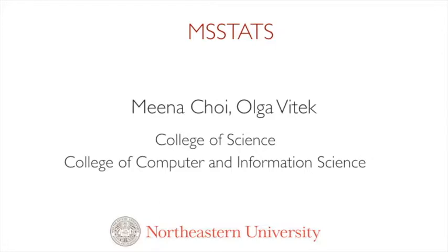And so today, what we would like to do in our group is to continue on statistical methods with R, but now, unlike in the previous 2.5 days, we will focus specifically on quantitative mass spectrometry-based experiments. Last week, we introduced basic R and also basic statistical methods such as hypothesis testing, error bars, planning sample size, and basic plots and things like that. So this 2.5 days, we will work on data specifically as they come.